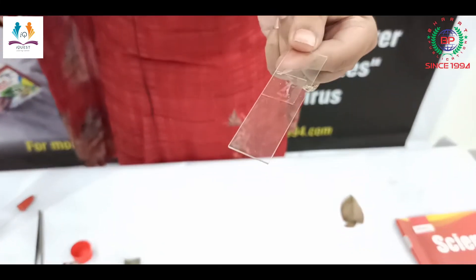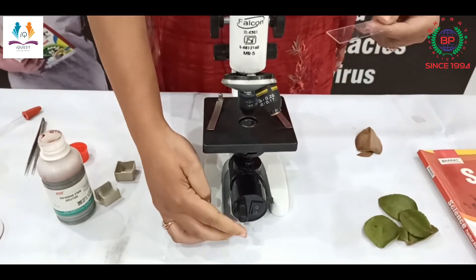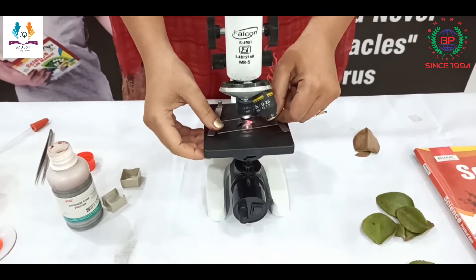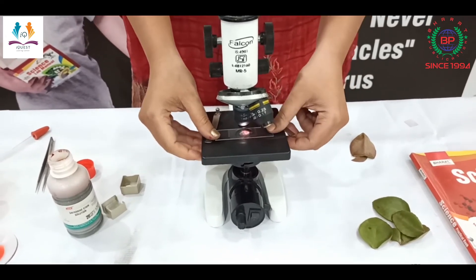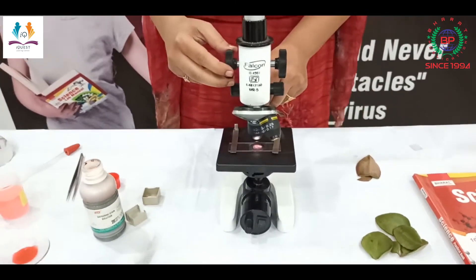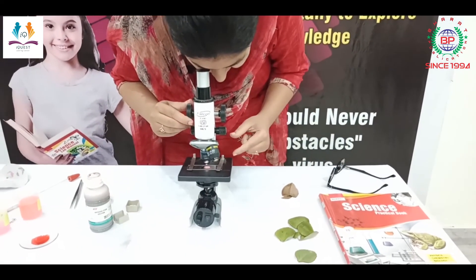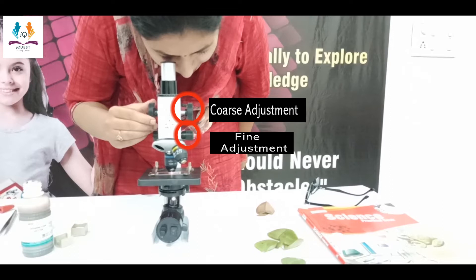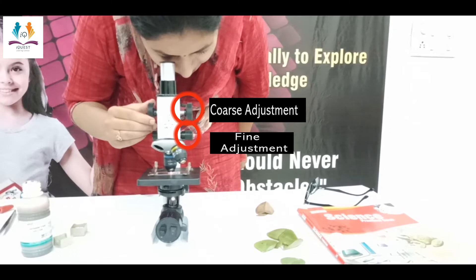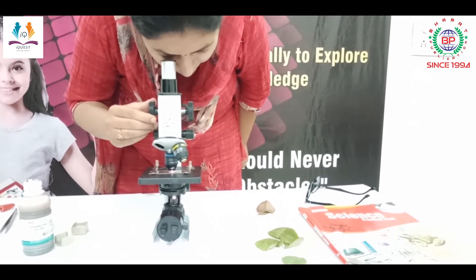Now I am going to see this slide under the compound microscope. I will keep this slide on the stage and adjust it. Firstly I will do the coarse adjustment, and then the fine adjustment. Now we will see the microscopic structure of stomata.